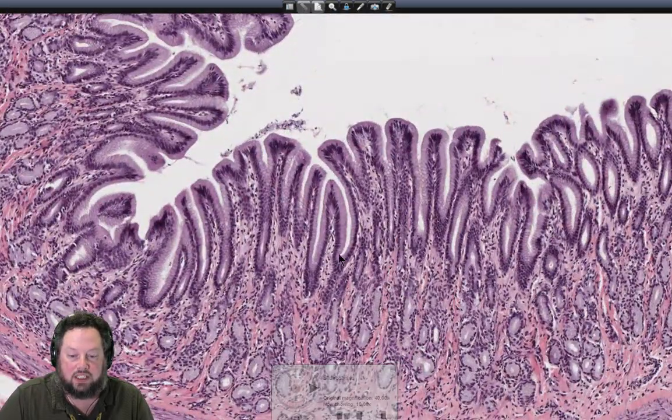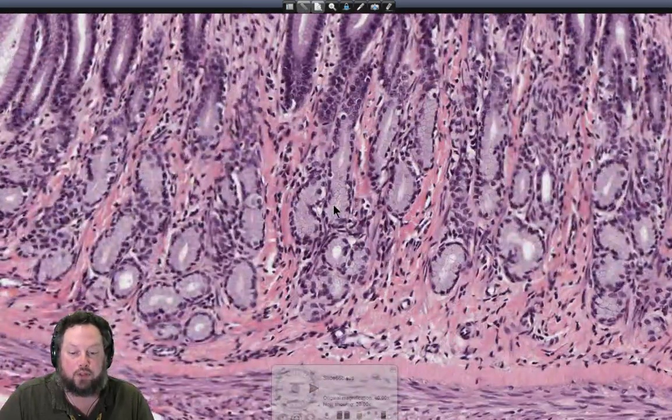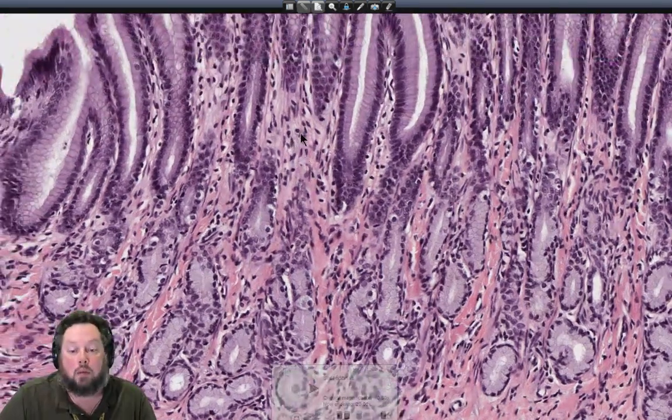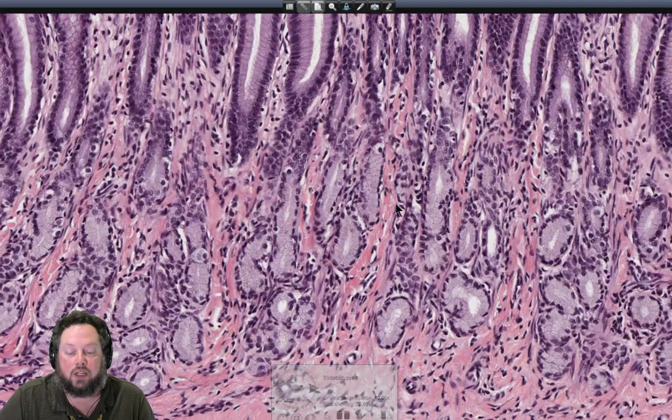So these are the deep gastric pits, and then the glands here are mucus secreting, so entirely mucus secreting glands, flattened basally located nuclei, very pale staining apical cytoplasms, and you can see a relative amount of lamina propria once again between these glands and between the gastric pits here. So certainly you couldn't confuse this for the body fundus region of the stomach.